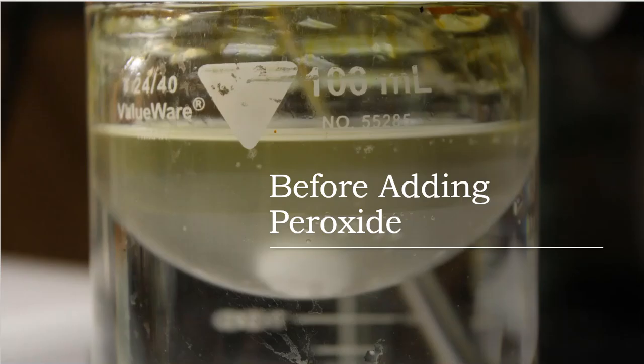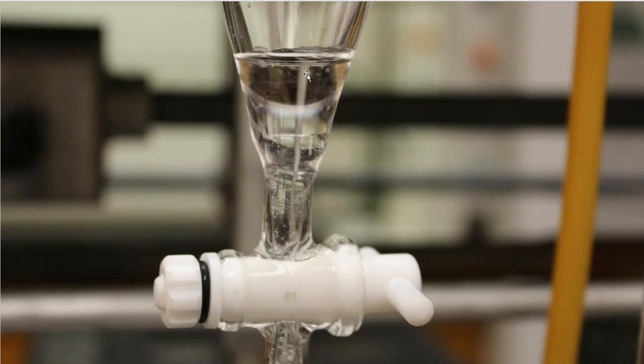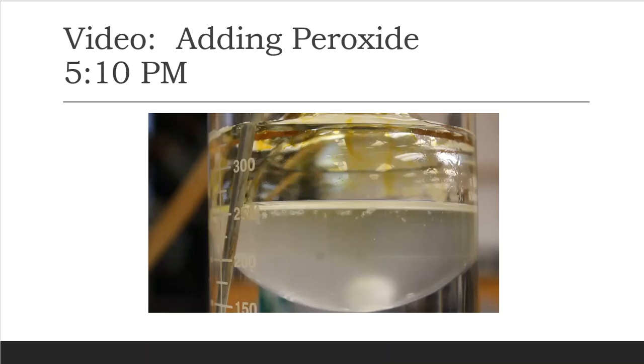All right, so here is the image of what this looks like before adding my peroxide, and now I'm getting ready to add my hydrogen peroxide. So my hydrogen peroxide is going to go into the separatory funnel up above, and here it is. And I'm getting ready to slowly add the hydrogen peroxide to that solution. I begin this at 5:10 p.m. If you need a timestamp for that, there it is. And once more, this is a video of me adding the peroxide to that solution.